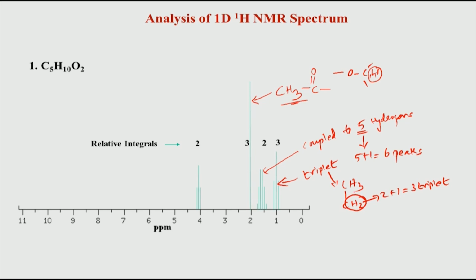So, what has happened is this particular CH3 that you see. We will explain this in more detail. Because there are 3 hydrogens, it is showing an integration value of 3, and it could be attached to a CH2, because of which there is a coupling between these two, between this methyl and this methylene. Because there are 2 hydrogens, this methyl will show a triplet, and that is what you see here. And this sextet is coming because of a hydrogen which is coupled to 5 hydrogens, and we expect this kind of a moiety.